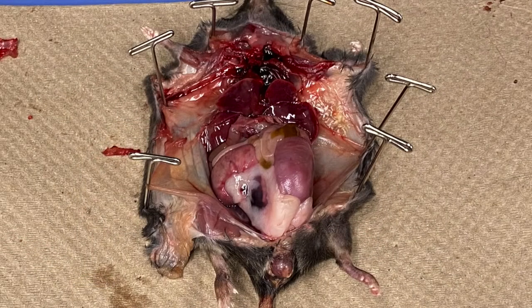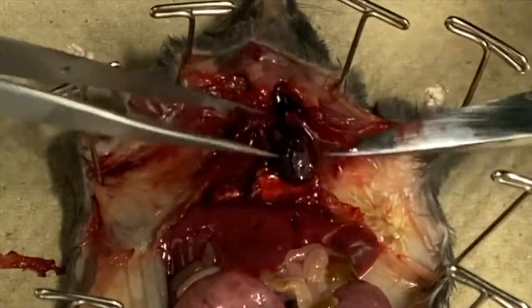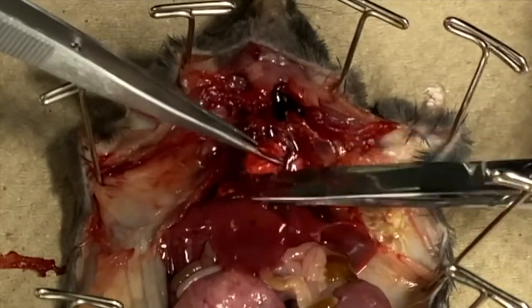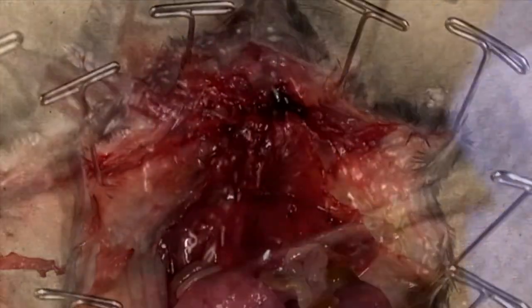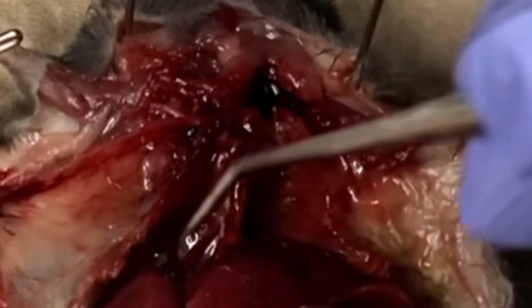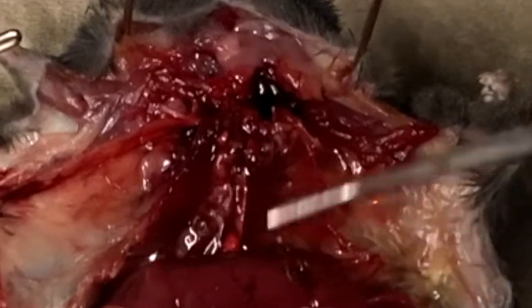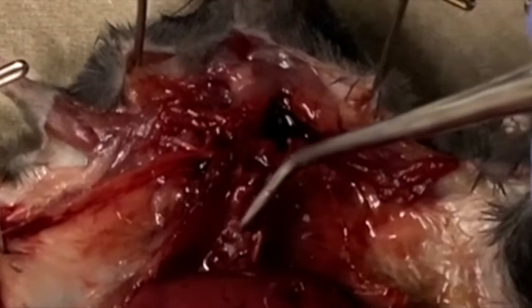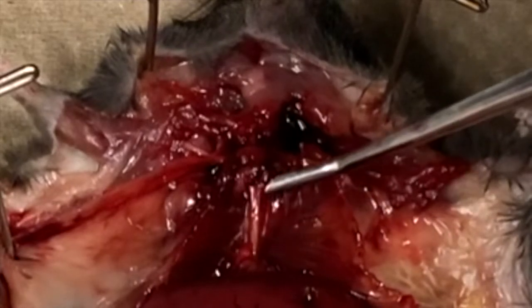Before exploring further, you may want to take a picture of your mouse. If you would like, you can remove the heart and lungs in order to get a better view of the trachea and esophagus. With the heart and lungs removed, you can better visualize the trachea on the left and esophagus on the right. The trachea allows for the passage of air into the lungs, while the esophagus delivers food to the stomach.